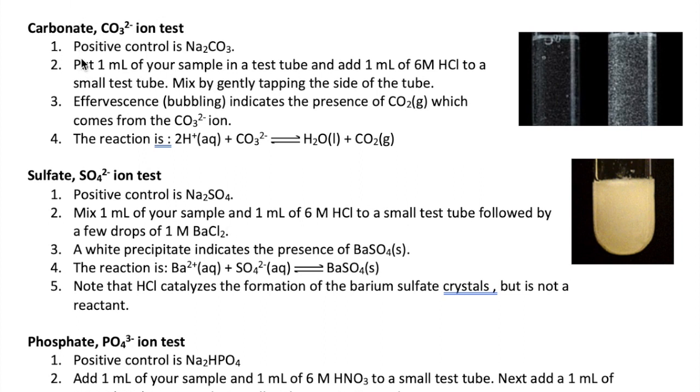Okay, the first test we're going to do is for the carbonate anion, and sodium carbonate is the positive control. Here you will mix one milliliter of your sample with one milliliter of HCl. You should start seeing small bubbles float to the top. This is carbon dioxide gas that's formed from the reaction between protons in your HCl and carbonate ion.